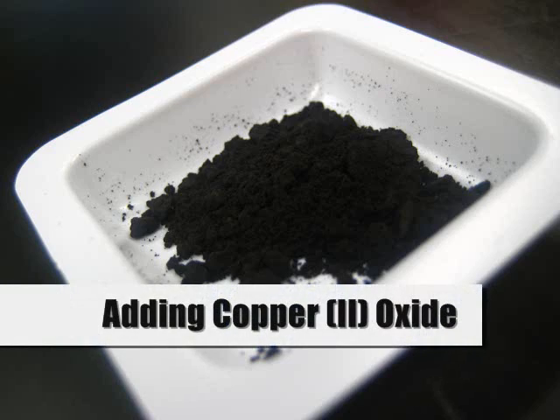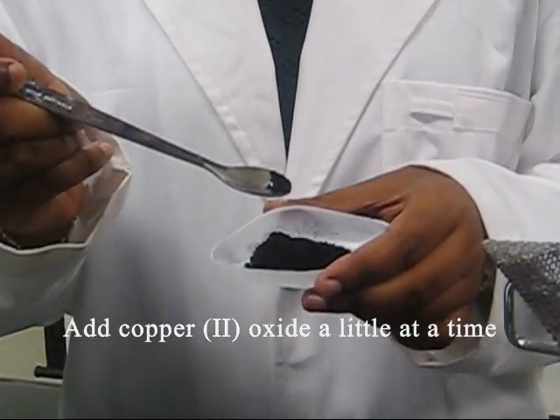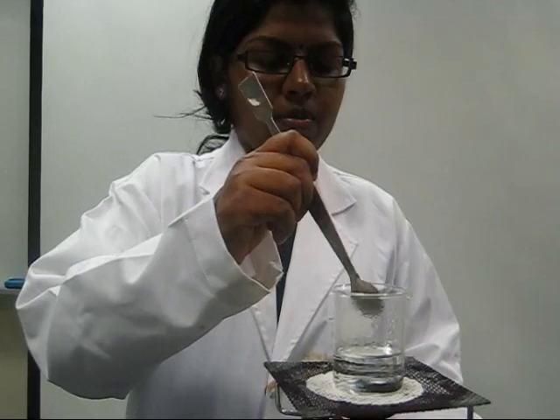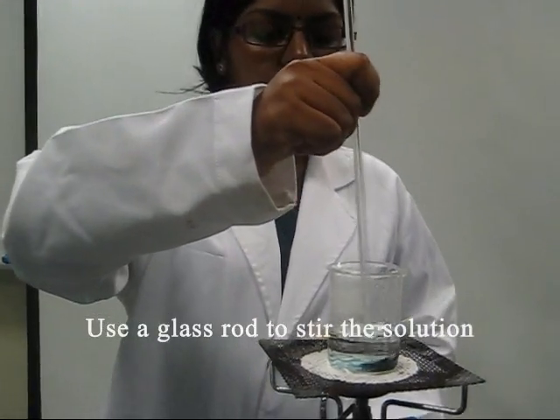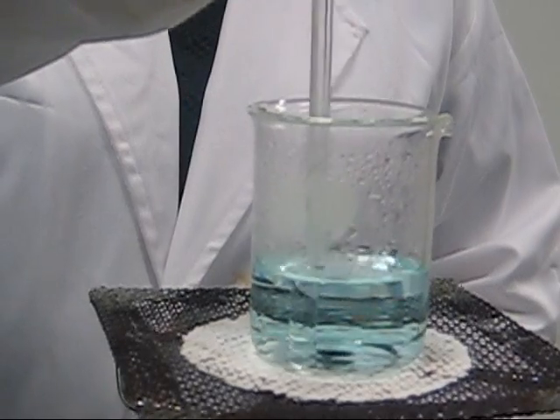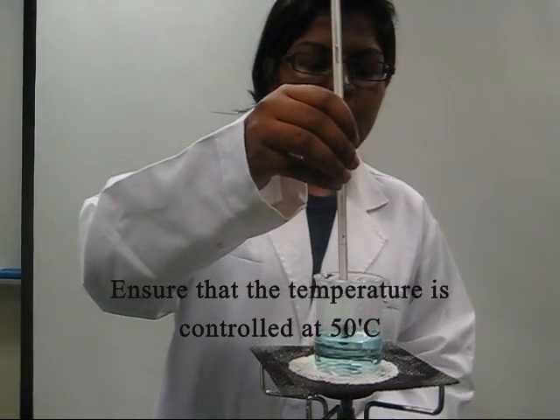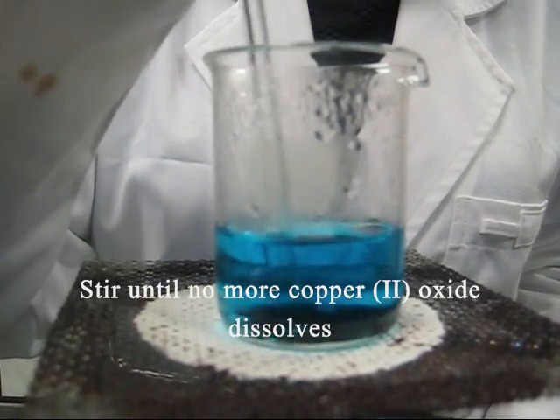Add copper(II) oxide to the sulfuric acid, a little at a time. Use a glass rod to stir the solution. Ensure that the temperature is controlled at 50 degrees Celsius, and stir until no more copper(II) oxide dissolves.